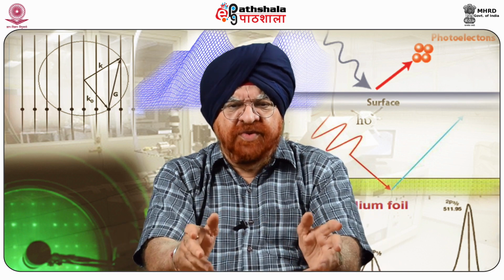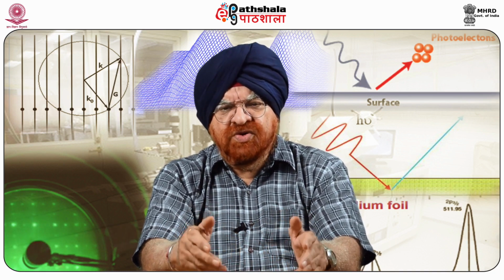CFM imaging of systems such as polymers, biomolecules, and other materials could produce direct images of the spatial distribution of functional groups, hydrophobic versus hydrophilic domains, and the time course of surface reorganization. Therefore, in conjunction with the adhesion data, CFM can distinguish between functional group domains in organic and aqueous solvents. I hope you have understood the potential of CFM towards imaging various important areas of chemistry.